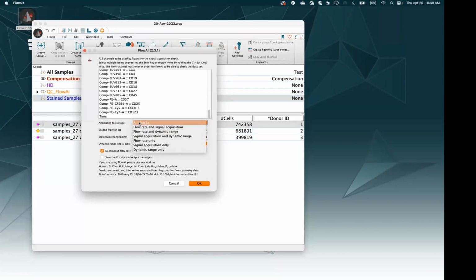I would start with all checks here. There are some other tunables to make the algorithm more or less aggressive. We have set a default that would work in most cases, but if you want to adjust those values, you can read the paper below in case you need to know exactly how to adjust them.